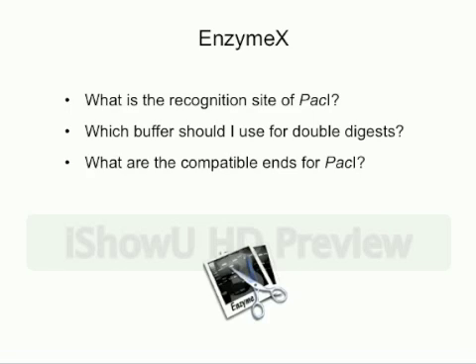So does this have restriction enzyme cutting sites and stuff like that? Is that basically what it is? Yes. If you choose an enzyme, it'll tell you whereabouts in your sequence it will cut. If you paste in a sequence and choose the enzymes, then you will get fragments. I'll show that once.